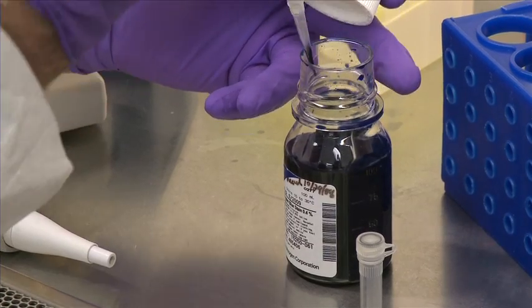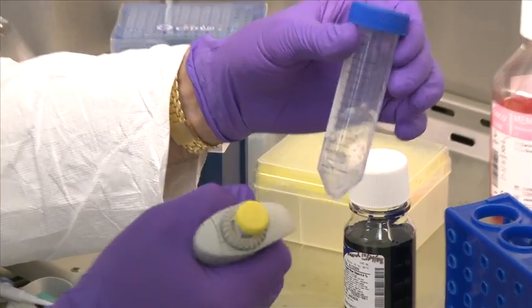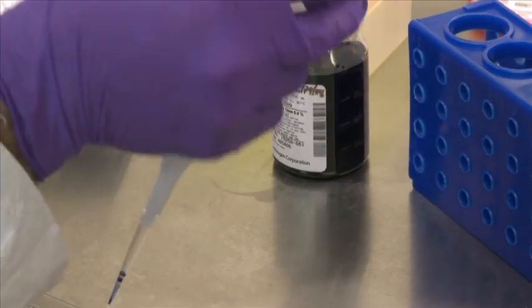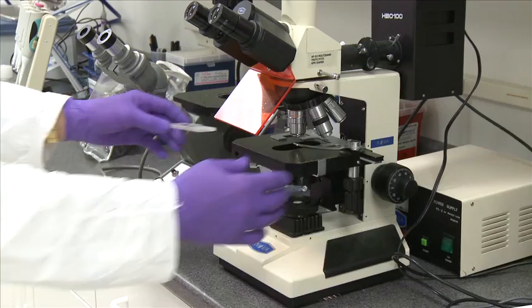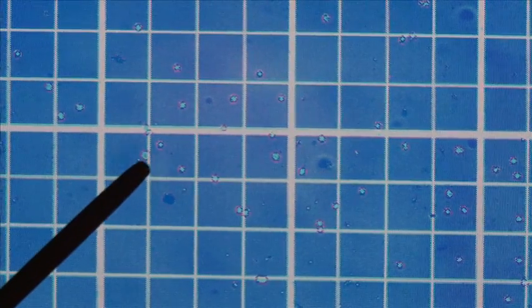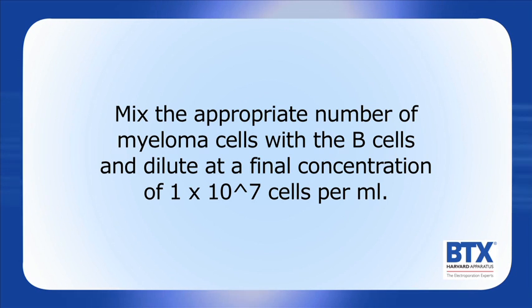Take 90 µL of Trypan Blue and pipette into a microcentrifuge tube. Resuspend the cells by flicking the pellet gently. Take a 10 µL sample of cells and mix with the Trypan Blue by gently flicking the tube. Add 10 µL of the sample to a hemacytometer and view cells under a microscope. Trypan Blue stains dead cells; dead cells will be blue and live cells will be white. Count live cells and perform a calculation to determine cell density. Mix the appropriate number of myeloma cells with the B cells and dilute to a final concentration of 1×10⁷ cells per mL.